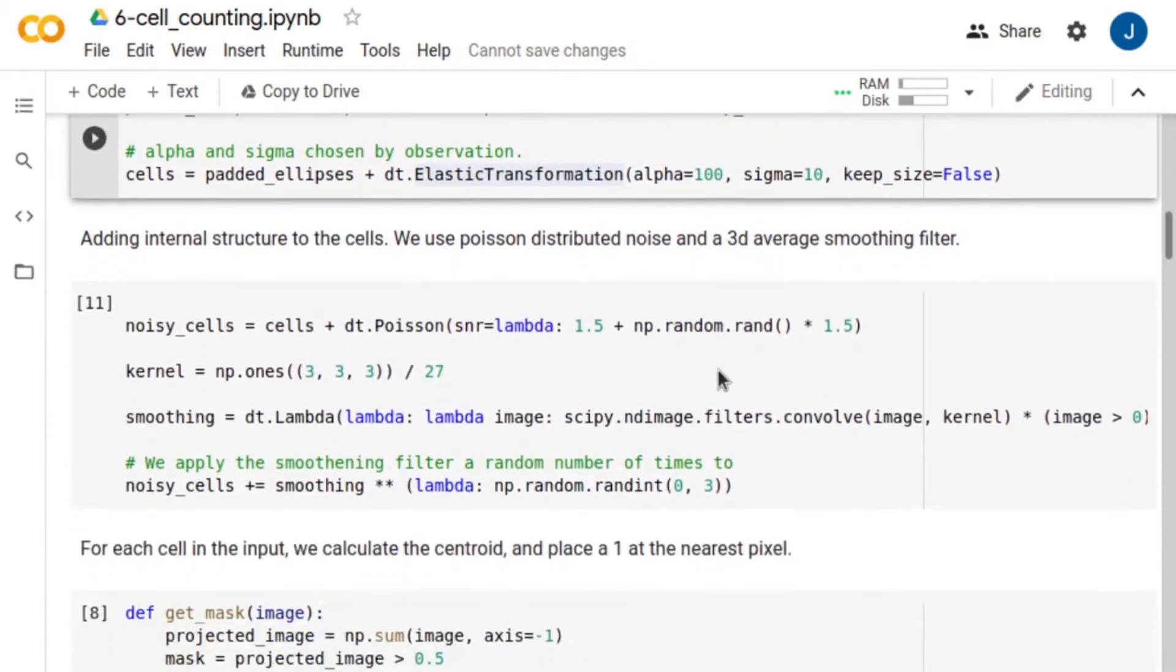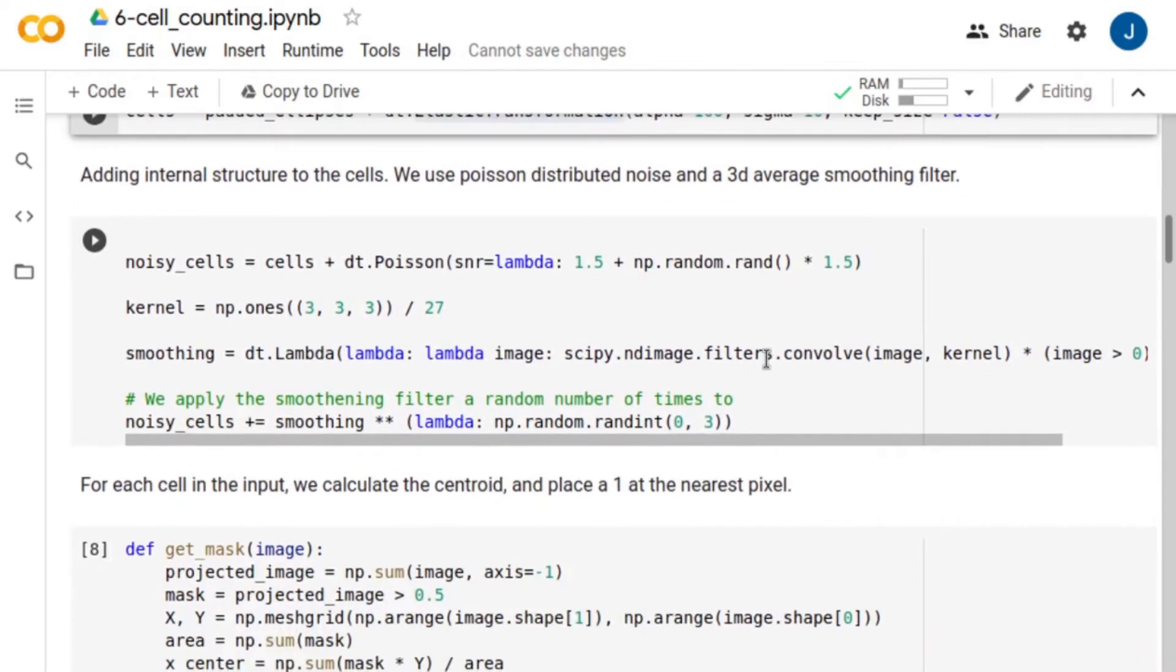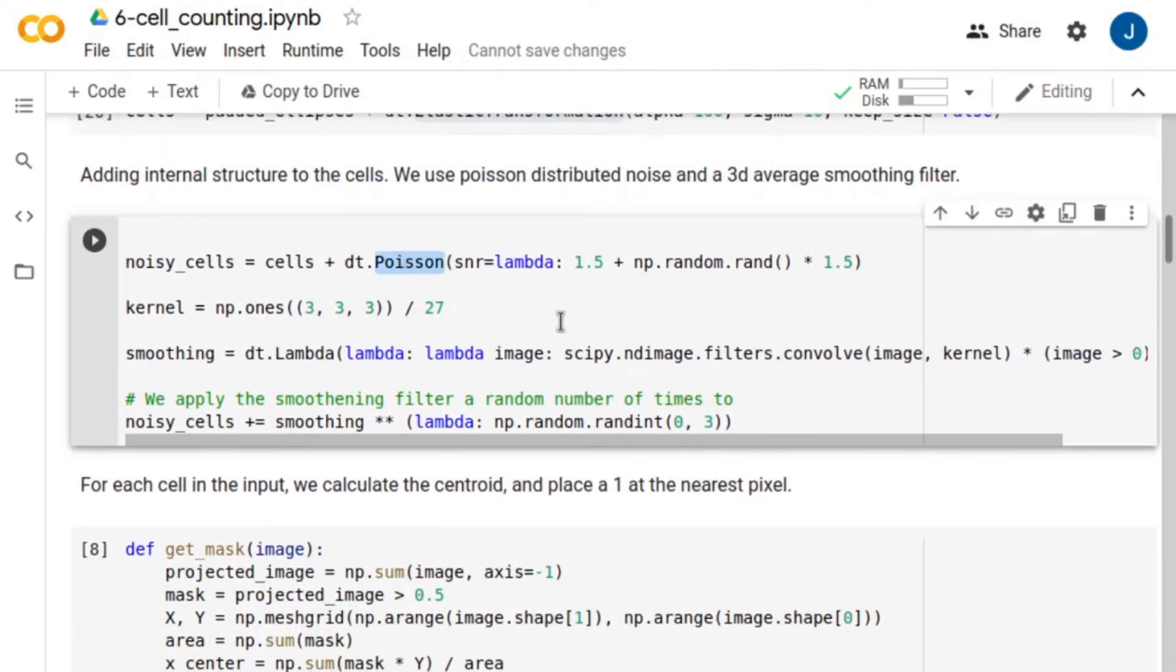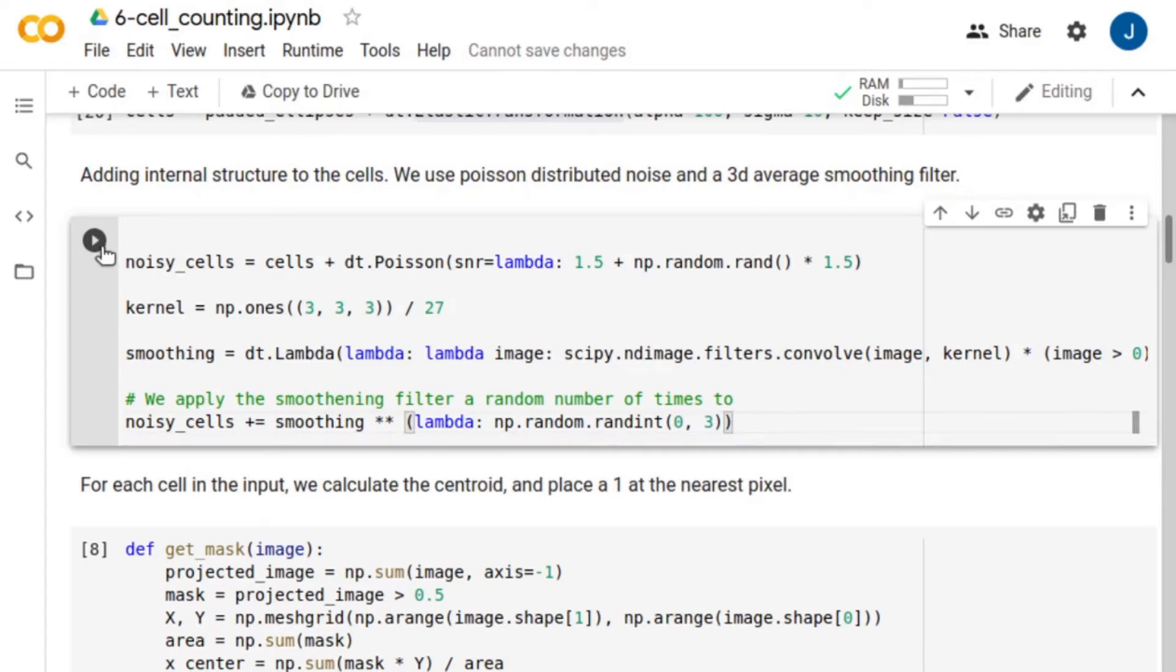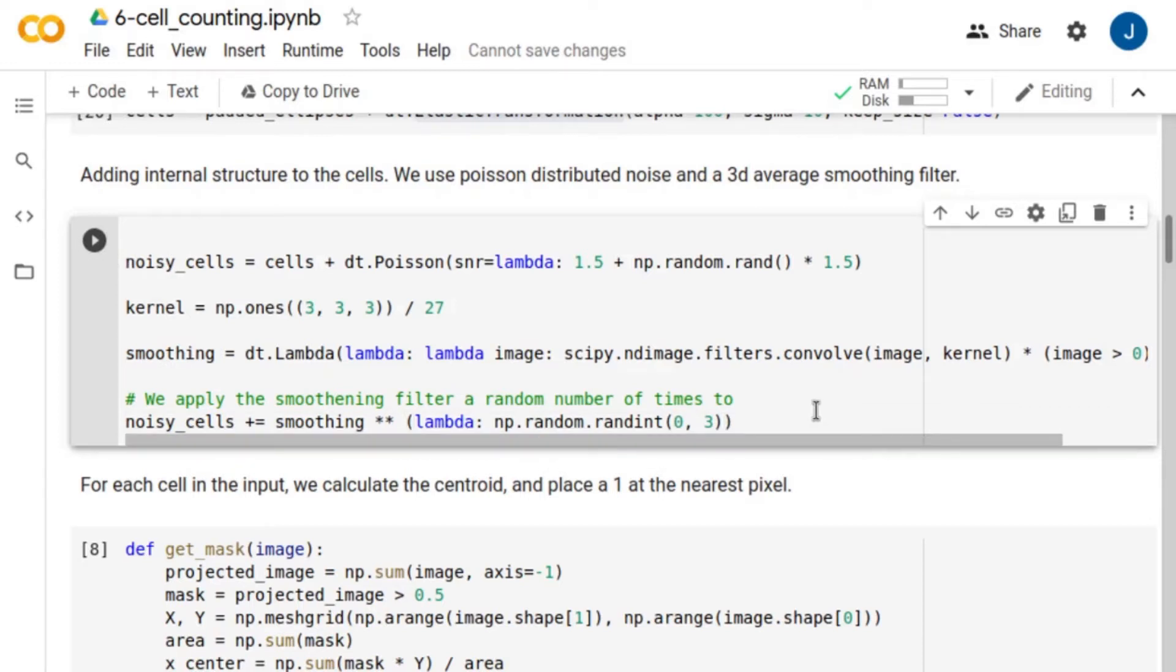The internal structure of the cells is simulated as Poisson noise with a signal-to-noise ratio between 1.5 and 3. Also, we apply a 3D average smoothing filter to the cells a random number of times between 0 and 3. Doing this allows us to generate cells with different internal textures, some smoother than others, which resemble the experimental conditions.